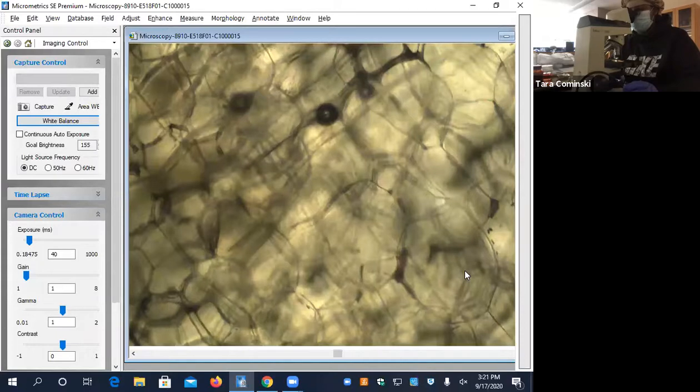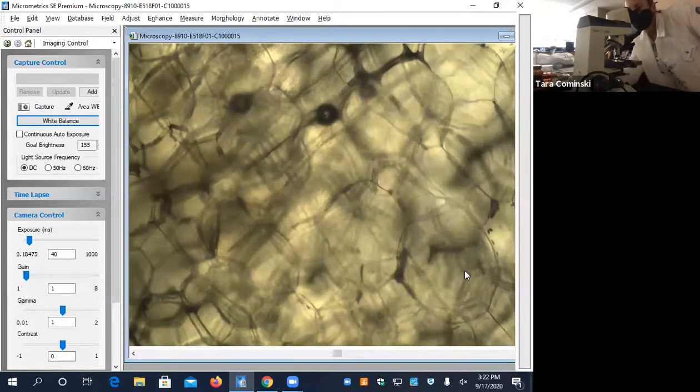Did you get it in? Switch to the 10x and try to get in there. So it's going to look something like this picture here. Does this look good, or should I...? Yeah, I think that's fine. I don't think you're going to get better than that.